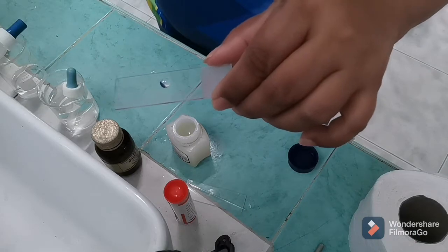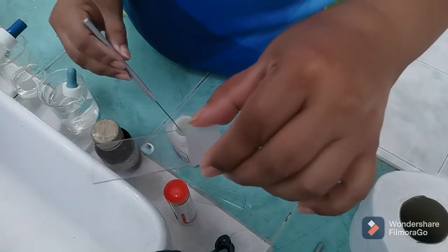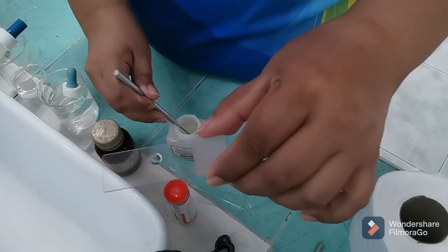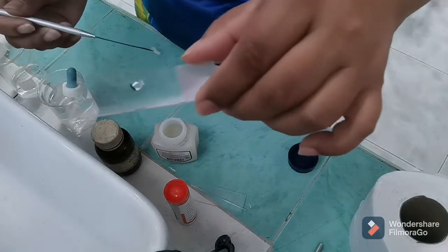And then the next is, through the use of the needle, I could get some Vaseline and place it around the drop of water.